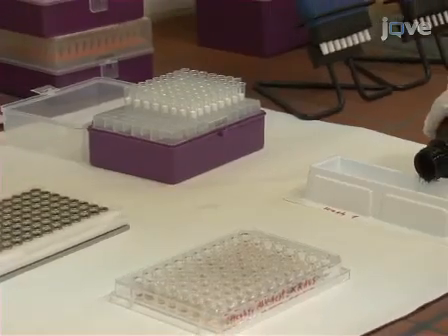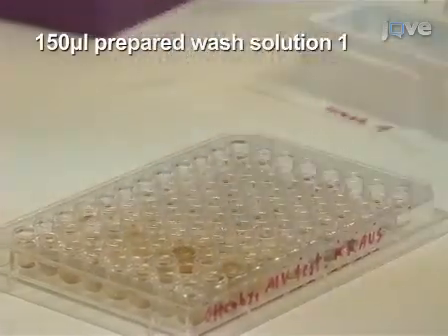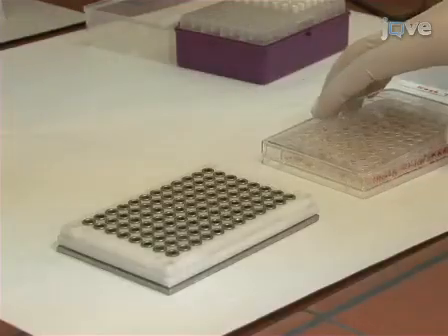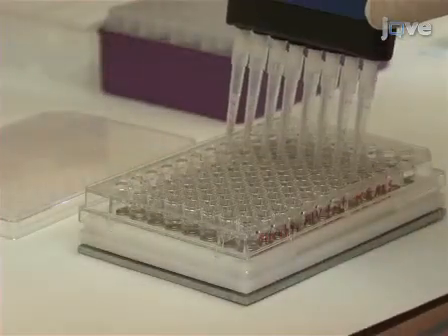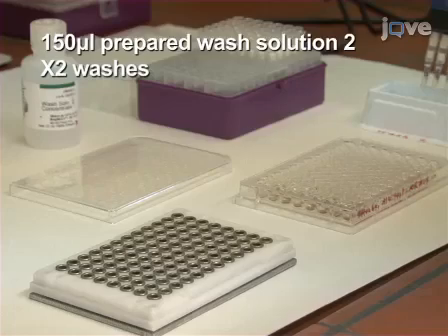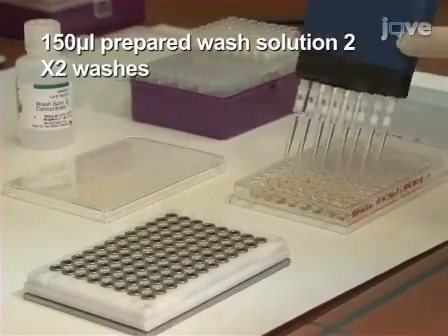Wash the beads by adding 150 microliters of prepared wash solution 1 to each sample. Shake for 1 minute. Then, capture the beads on the magnetic stand. When the solution is completely clear, remove and discard the supernatant. Repeat this wash once, then perform 2 washes using solution 2.